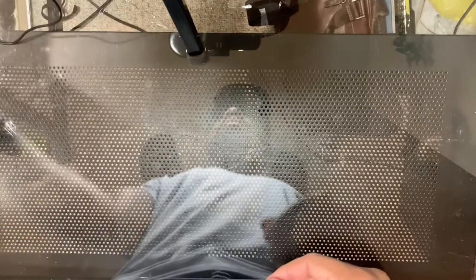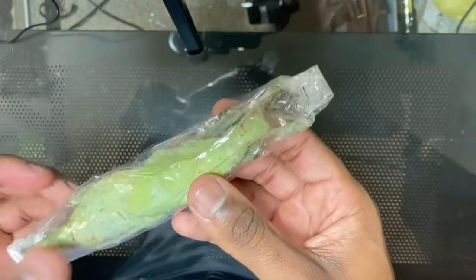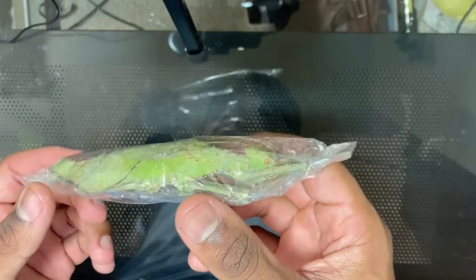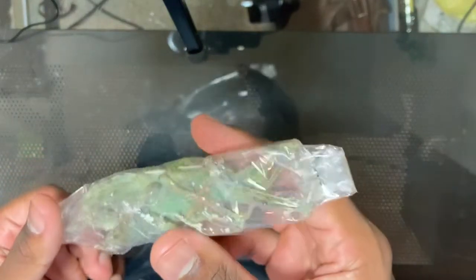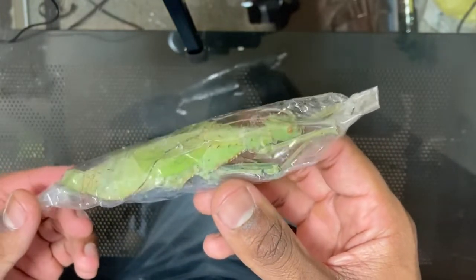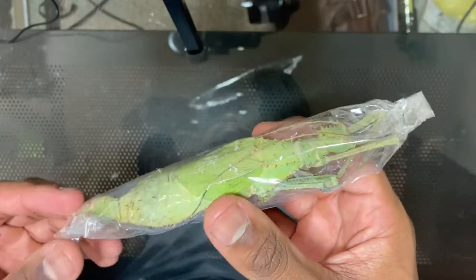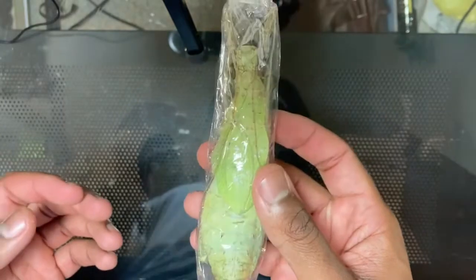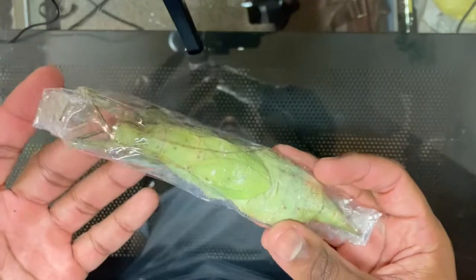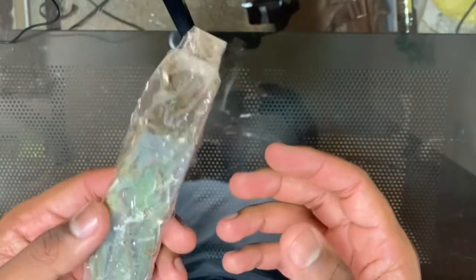The insect that I'm going to be rehydrating, pinning, and framing in this video is this big beautiful insect right here. This is an adult female Heteropteryx dilatata, commonly referred to as the Malaysian jungle nymph. This is a large species of stick insect found in Malaysia. I ordered it online — that's actually something you can do. You can order dead insects online, they'll get shipped to your house, and you can pin them yourselves.